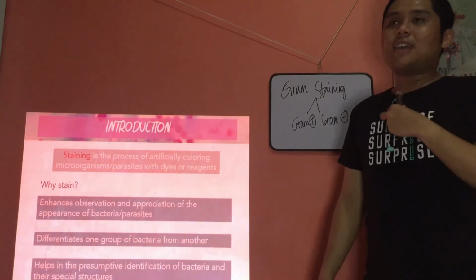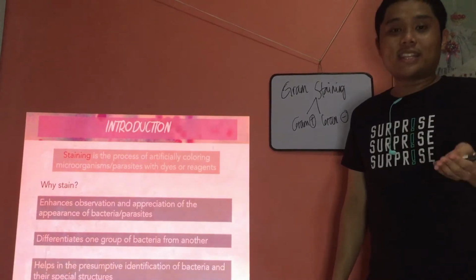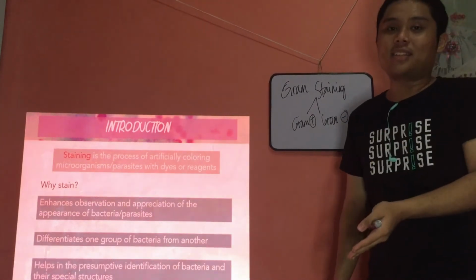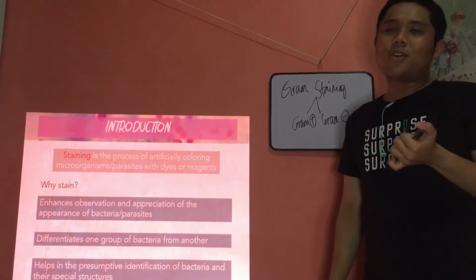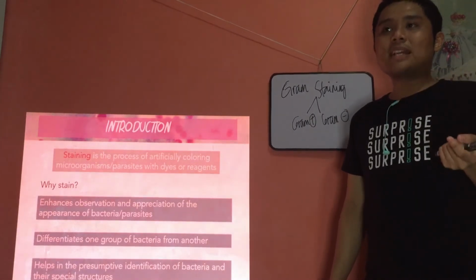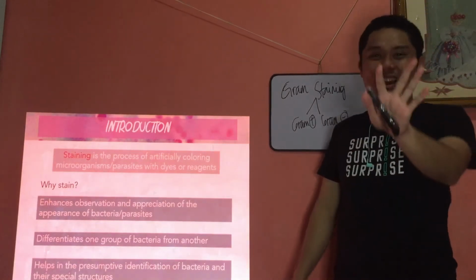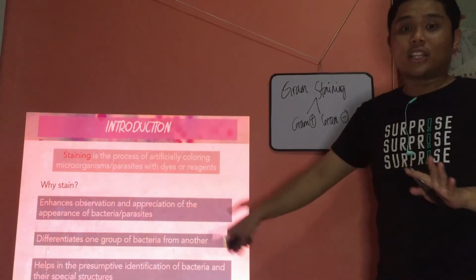As I mentioned, in bacteria, if you're already educated with the different bacteria, through Gram stain you can already have an idea as to the possible identity of the organism that you have in the specimen. Like, okay, gram-negative cocci coming from a urethral swab. Press the buzzer. This could be Neisseria. Gram-positive bacilli coming from a wound of a fish butcher. Maybe this could be Erysipelothrix. See? Calm down. You'll know that in your bacteriology. So that's the importance of staining.